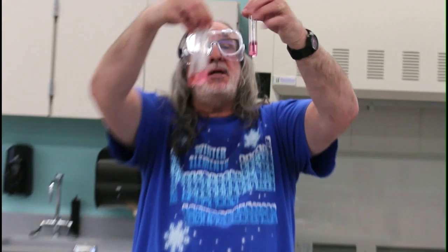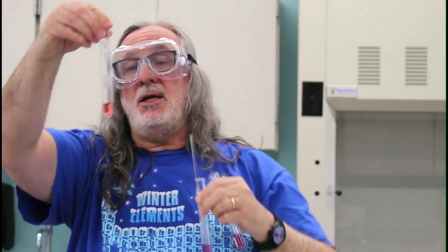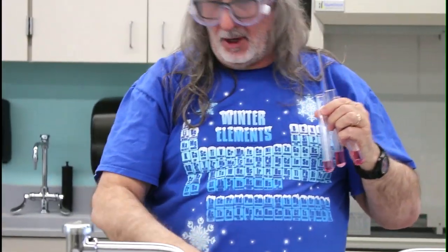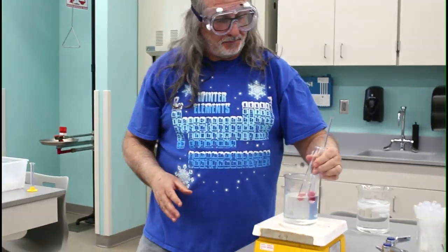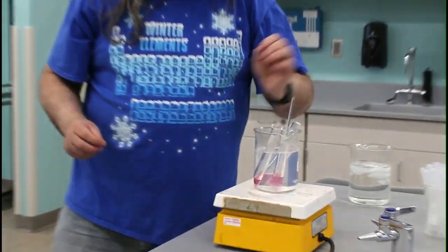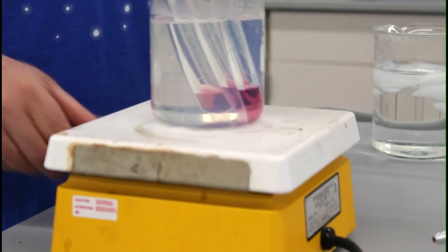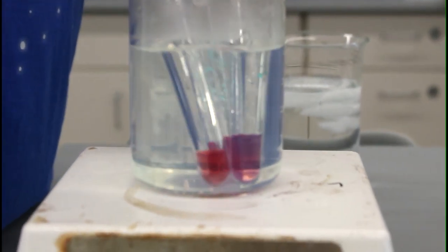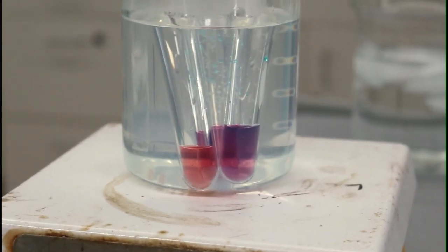So here are my 3 test tubes: the one with the HCl in it, the one with the ammonium chloride in it, and the control with nothing in it. I've also got a room temperature control here as well. I'm ready to put them in my hot water bath and heat them up and see what happens. And you can probably see the color changes that are taking place as it's heating up.